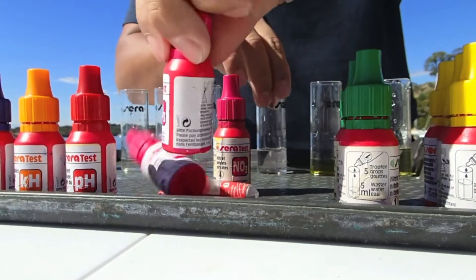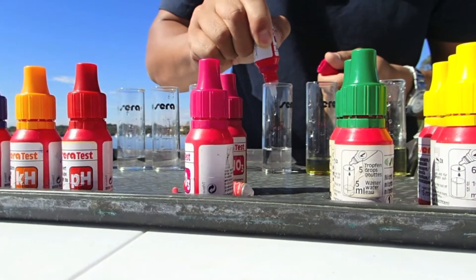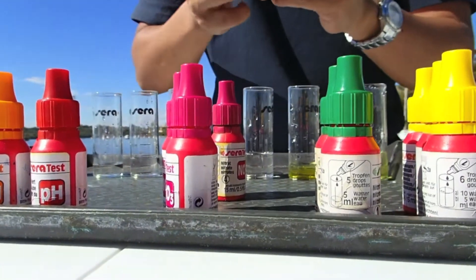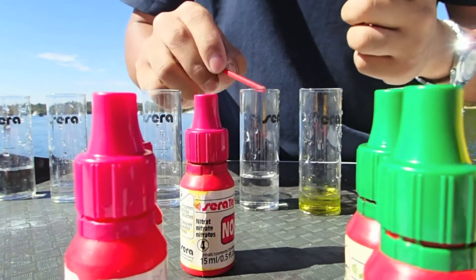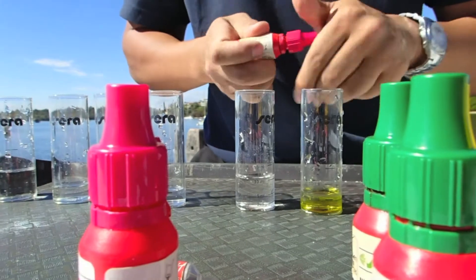The nitrite is 5ml. And with the nitrate, it comes with a powder, so you just put a scoop of this. The more reliable test kits will have more reagents for any particular test.